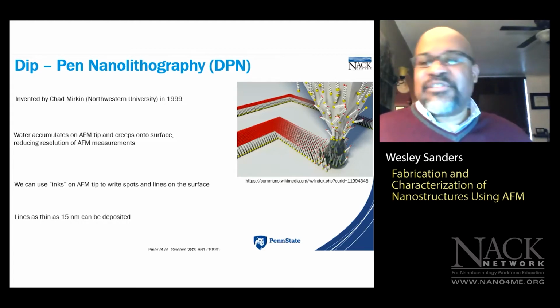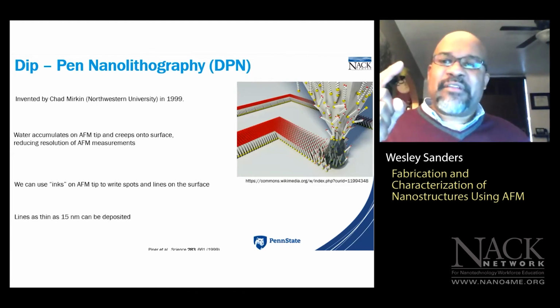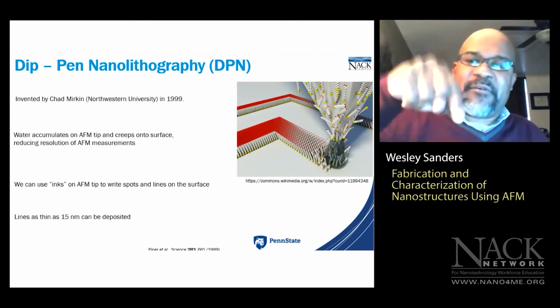Now, the nanoshaving technique that we just discussed a few minutes ago, that is a subtractive technique. In that particular case, the AFM tip is etching away a particular region in your film.